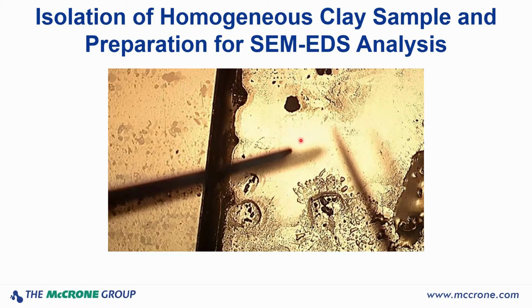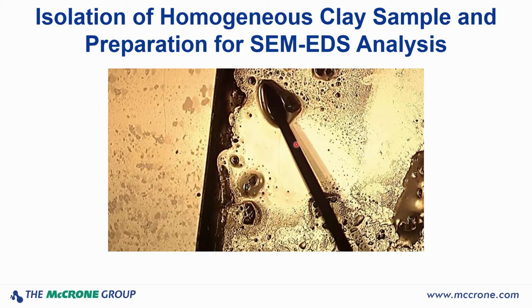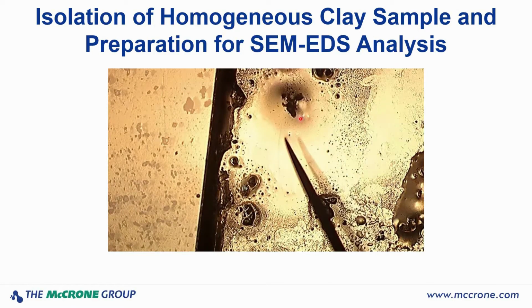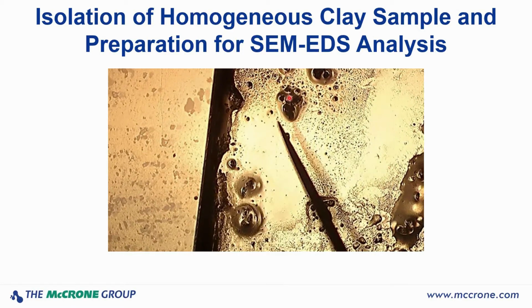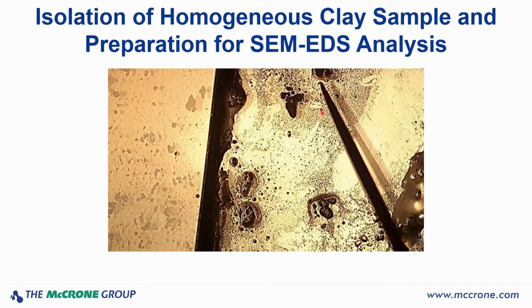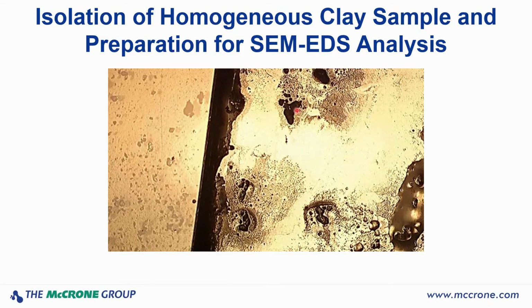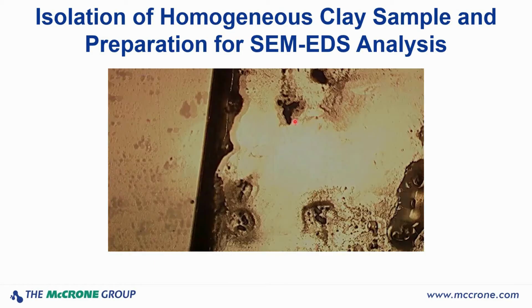Now we're going to come in and do a little more fine-tune washing. There's my amyl acetate, and I take my tungsten needle and wash that particle, run it over the top surface of that, and then I pull some of that amyl acetate away, which pulls away some of the remaining contaminating refractive index liquid.